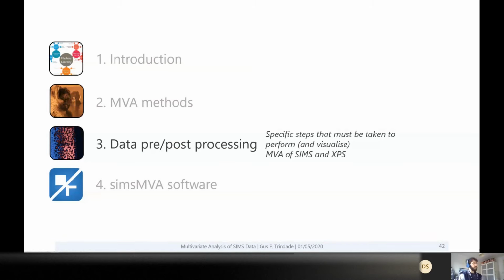Okay, so that covers the 2 main methods, at least the basics. We can always discuss more later, or if you have questions, I refer you to my PhD thesis, the first chapter. It covers all these things in a bit more detail.